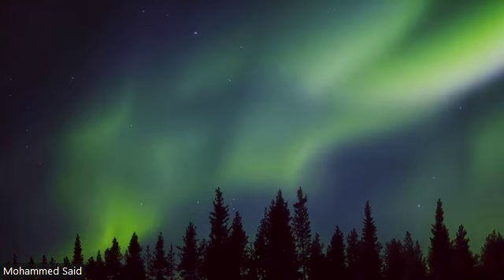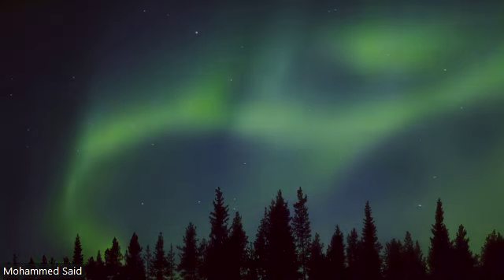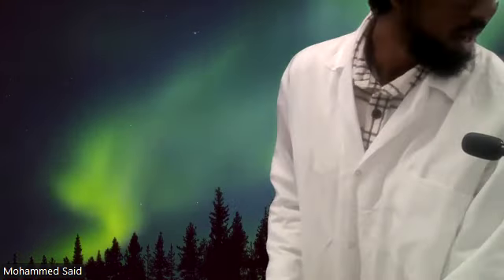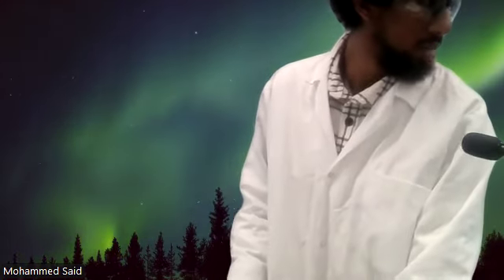What's everyone doing so far? If you can do the capsule stain, that would be amazing. If you are behind on your gram stain, then continue preparing your slides. It's okay. If you are ahead, then you prepare your hanging drop.